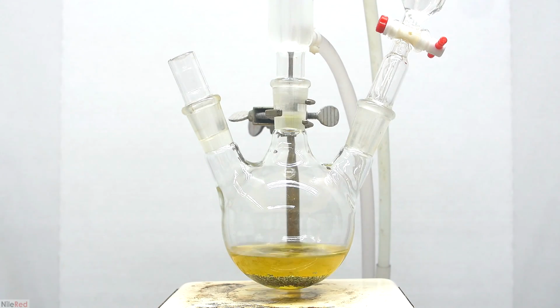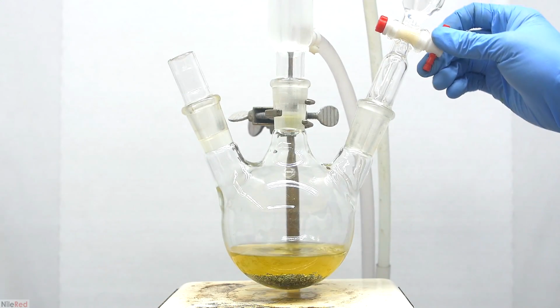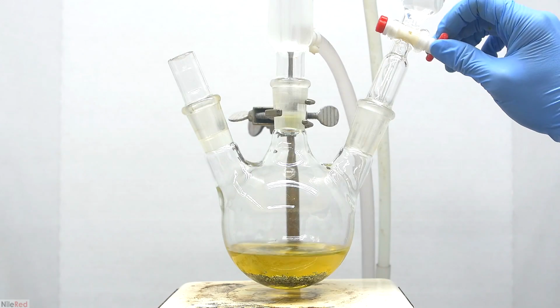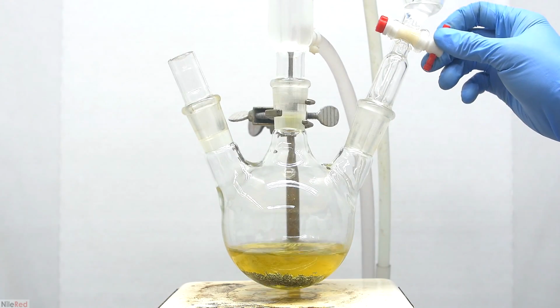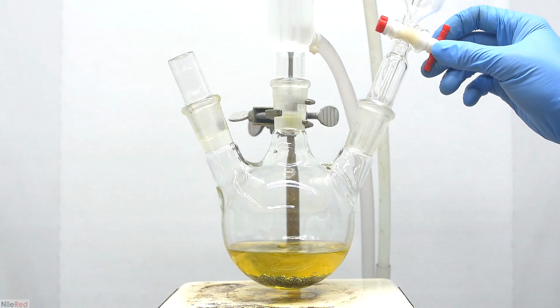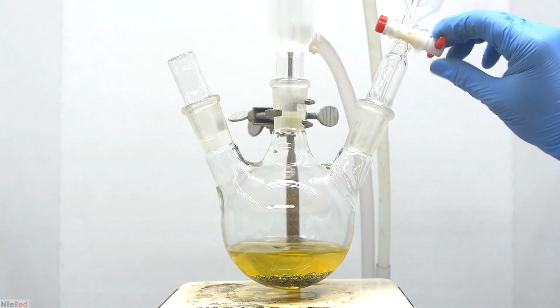When exposed to air, magnesium metal almost instantly oxidizes and forms a layer of magnesium oxide on the surface. In order for the reaction to proceed, we need to expose fresh magnesium metal, which can interact with the 1-bromopentane. Iodine disrupts the magnesium oxide layer and exposes magnesium metal chemically, but grinding with a glass stir rod does it mechanically.